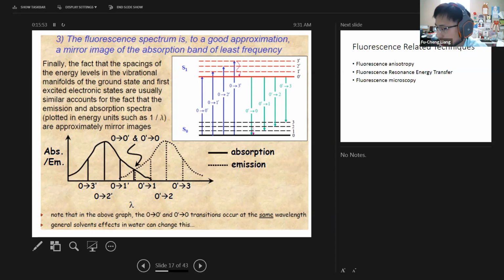So the x-axis in this plot is wavelength, all right? So this is typically the solid black line, the absorbance spectrum. And it's because your molecule can transition to different kinds of excited states at different energy levels. But again, for the green one, as you can see from the energy diagram on the right, they were able to release fluorescence.